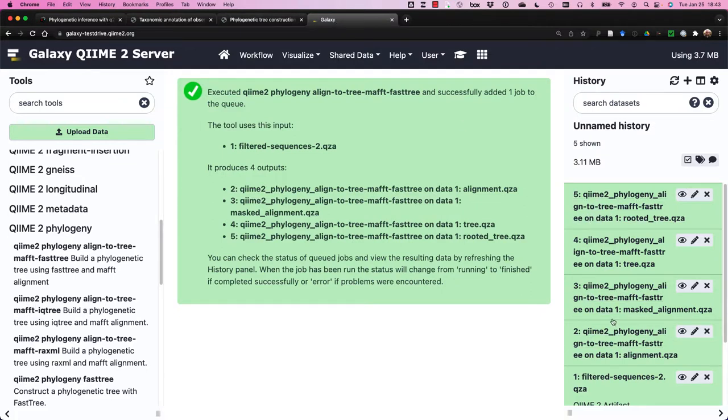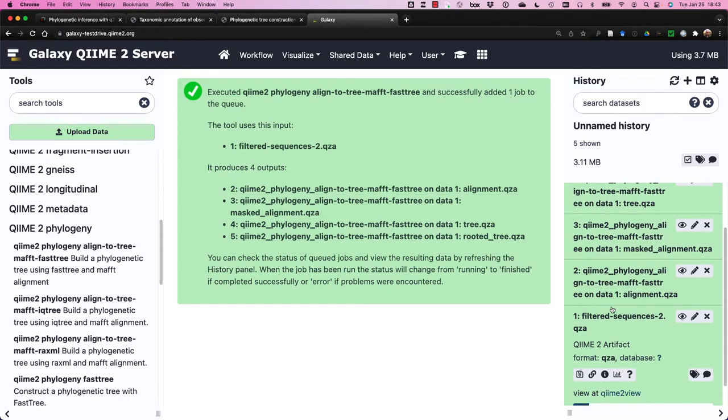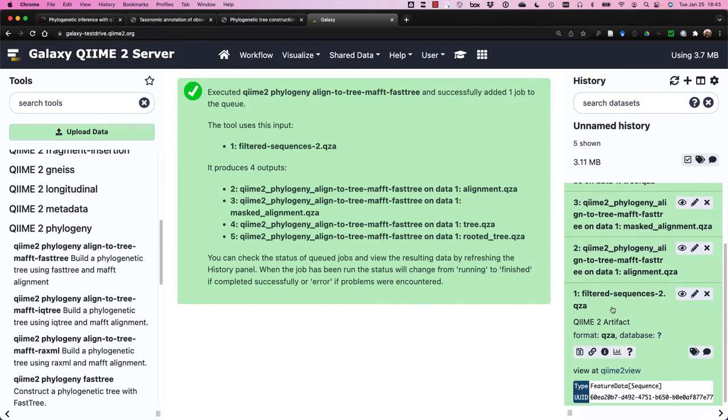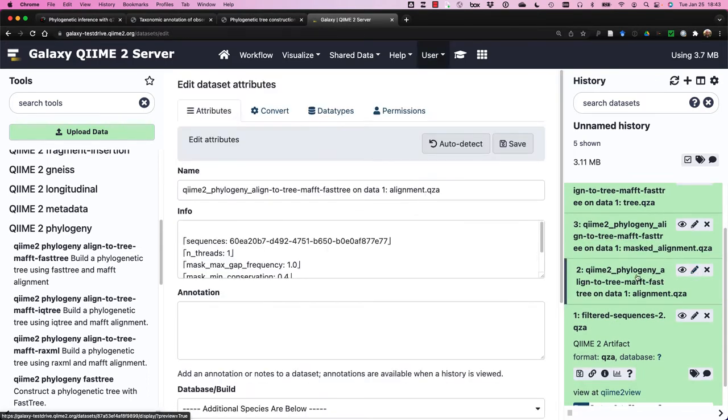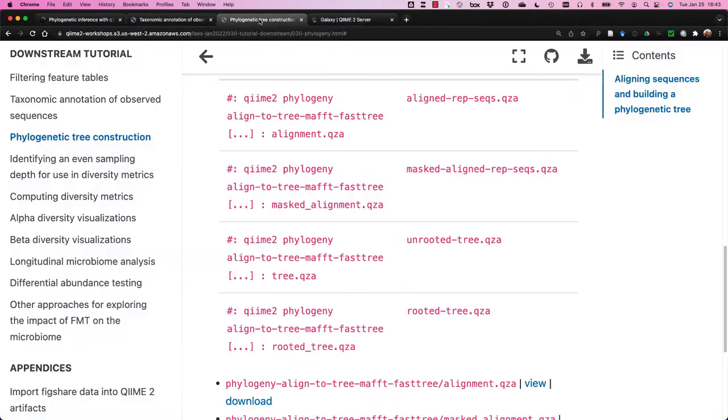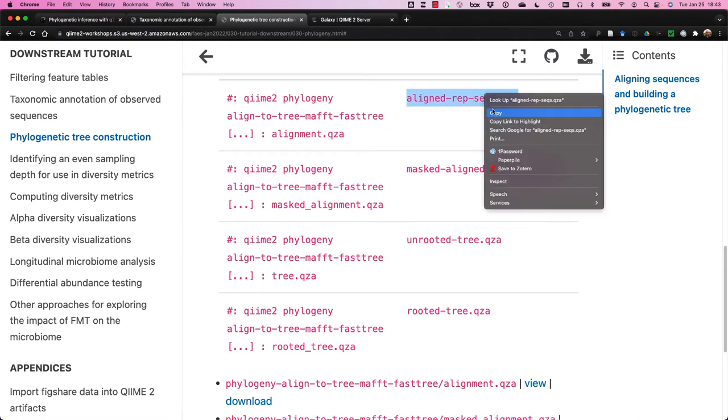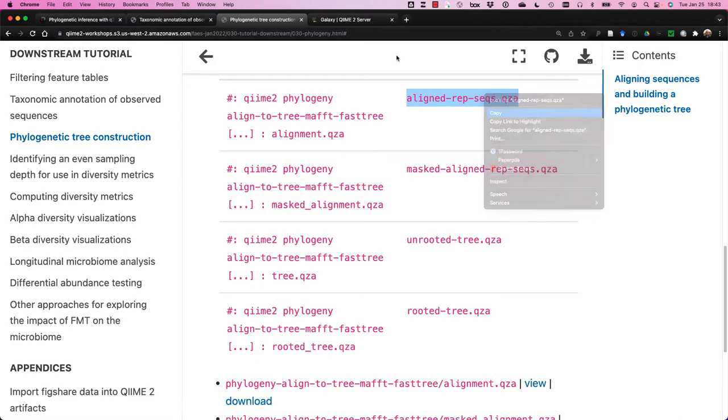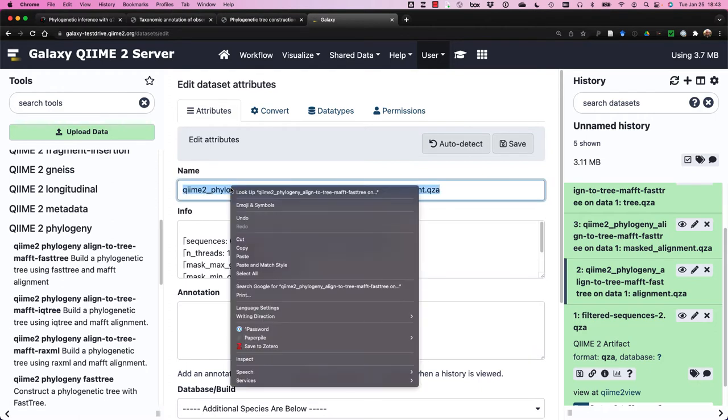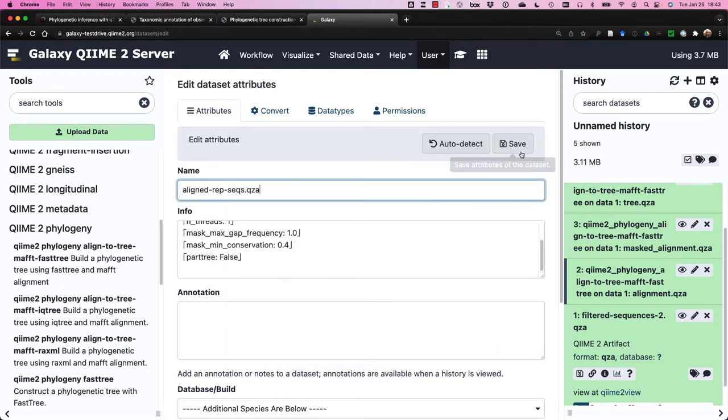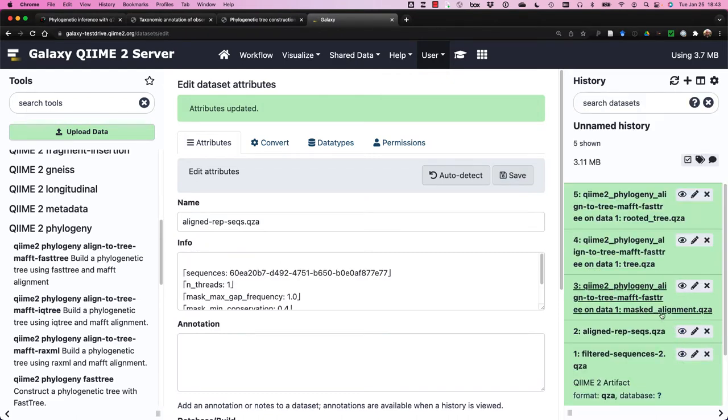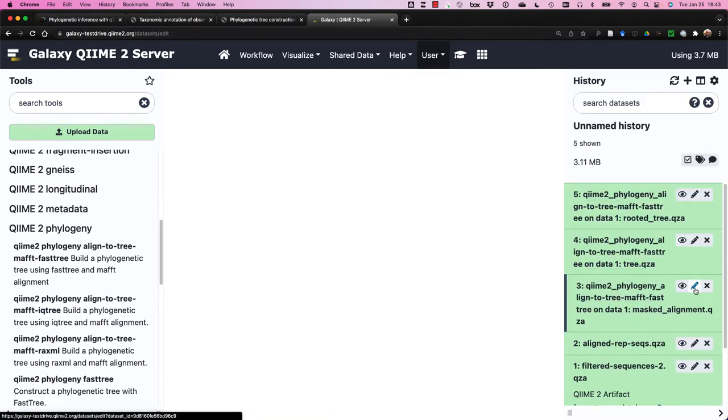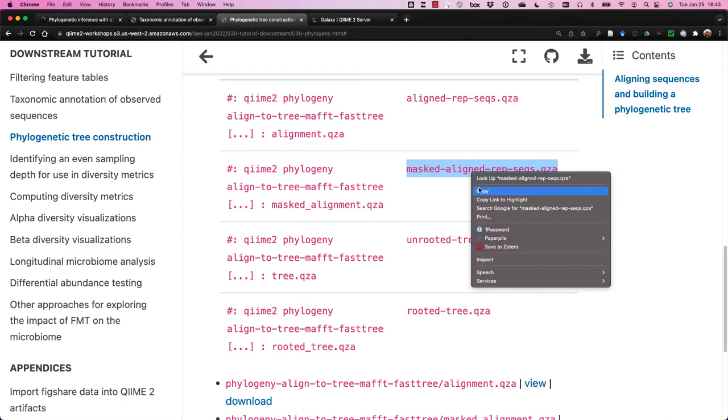Okay, so all of our files have been produced, and what I'm going to do now is edit these file names. So here is our alignment, and just to make sure, I'll go back to our phylogenetic tree construction tutorial. And we should call these our aligned representative sequences, and I'm going to paste that here, and then save. Then we are going to do the same thing for all of the files. So all I'm doing is making sure we keep our file names consistent.